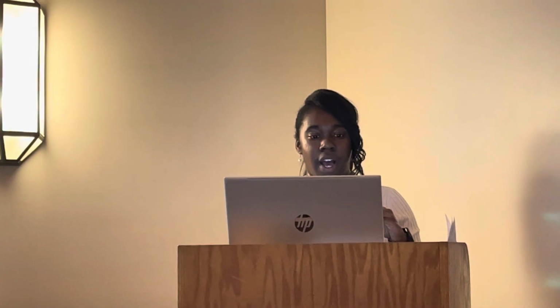And so zeolites are crystals, and crystals can grow in a couple of different directions, but zeolites specifically can grow in 3 dimensions as illustrated by the picture. They can grow in 1 dimension, 2 dimensions, or 3 dimensions in multiple different ways. So when I say that they can grow in multiple different ways, these are just some of the ways that they can actually grow. They don't just look like a regular crystal that you crack open in one of those National Geographic kits.